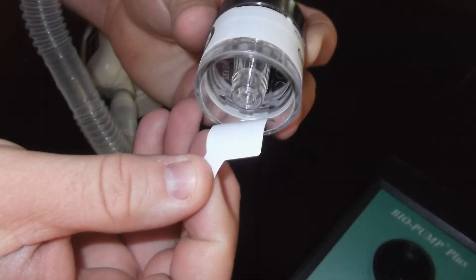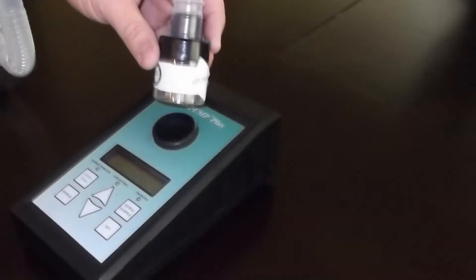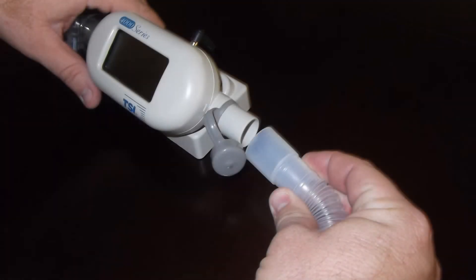Take the bio-pump calibration adapter and remove the aerosol tab from the calibration cassette. Connect the calibration cassette and adapter hose to the bio-pump. Once this is complete, connect the other end to the inlet side of the TSI calibrator.